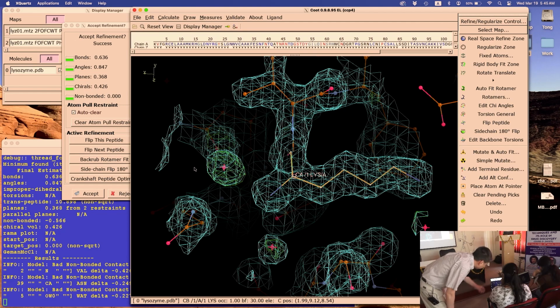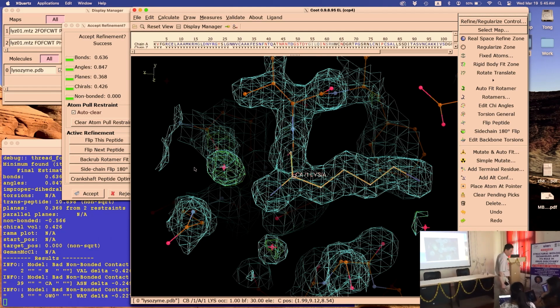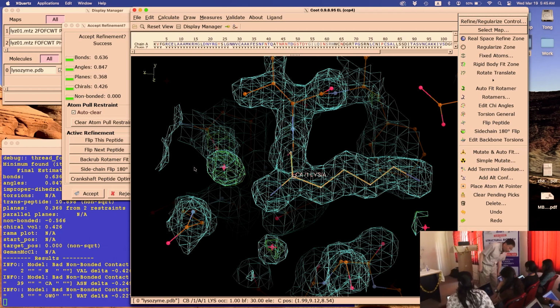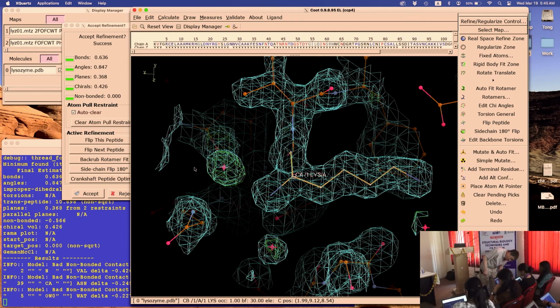Turn this a little bit. Turn. Turn. Yeah, without a mouse it's very hard. Okay. The Coot window closed unexpectedly. Did you build the lysine in? No, sir. I see. Are you on the valine? No, center on the valine. And then, starting again, build the lysine.